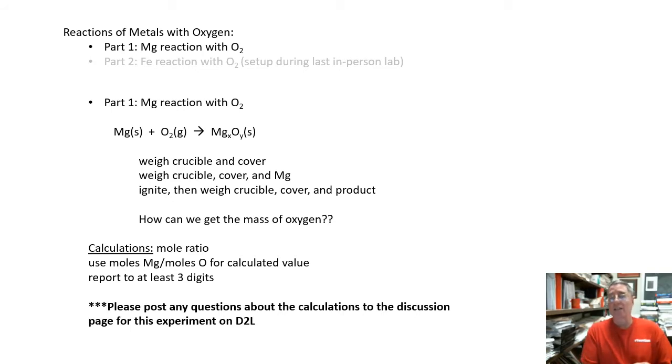First part, reacting magnesium with oxygen, you'll burn it in a crucible. And then part two is the iron reaction that's, I think, kind of interesting and neat because it sits and reacts over, in this case, almost 3 weeks, a month. And something kind of cool happens.